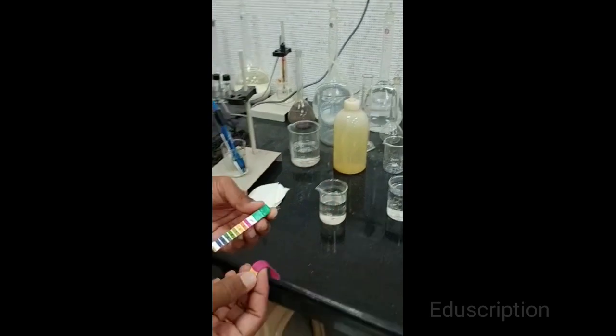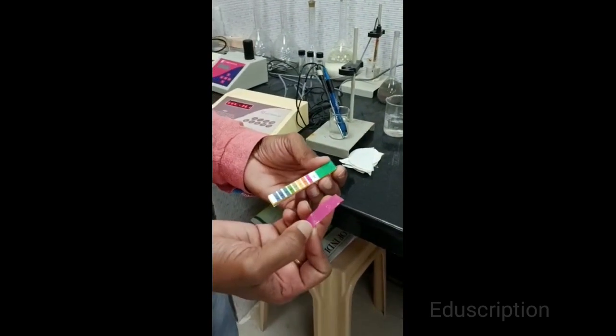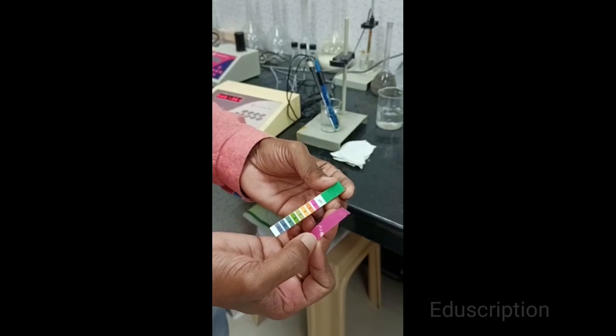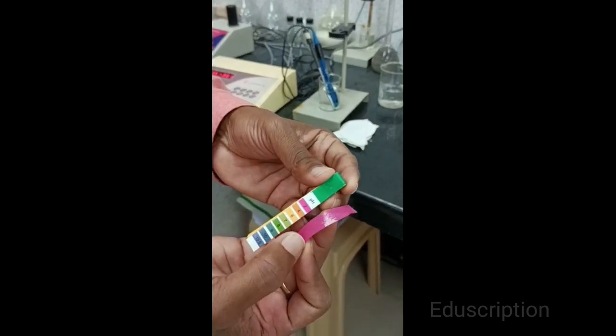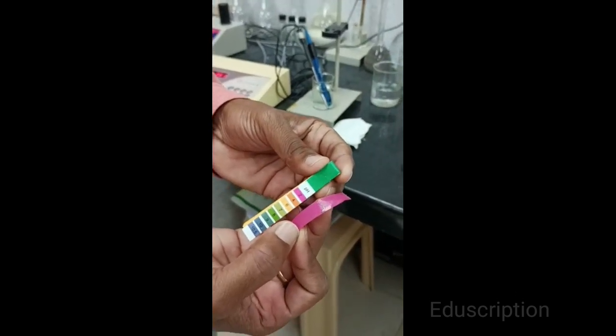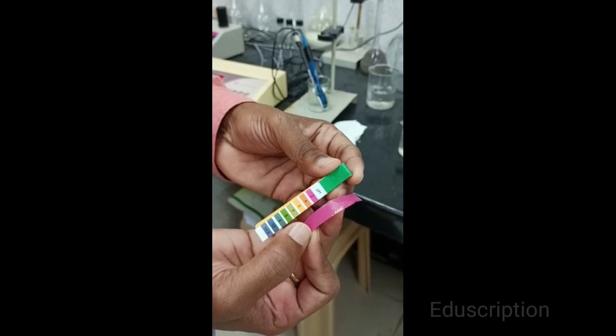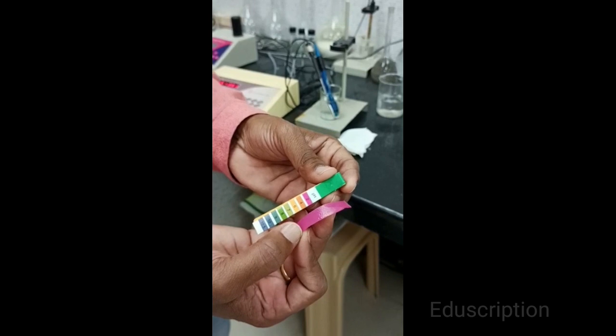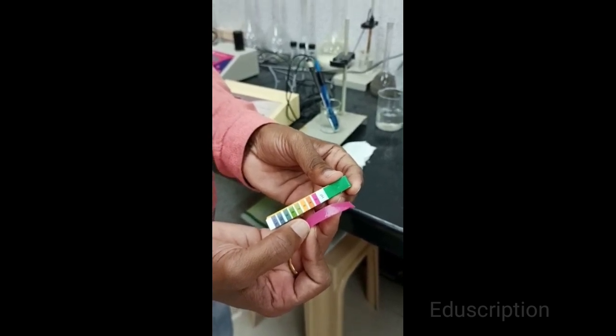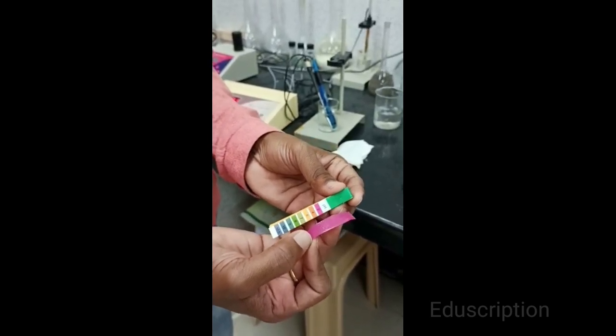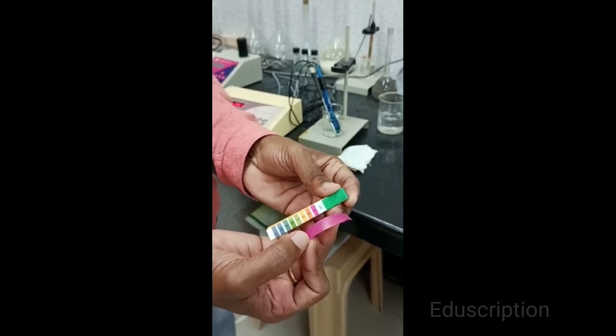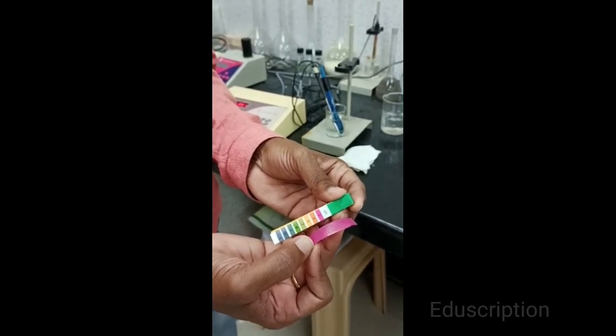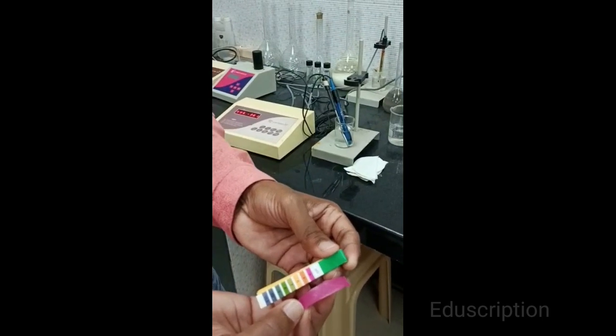Now we insert one pH paper in unknown solution. When you insert this in unknown solution it gives this pink color, so pink color of pH is 2, so it is pH 2. But here we cannot detect the exact pH value.